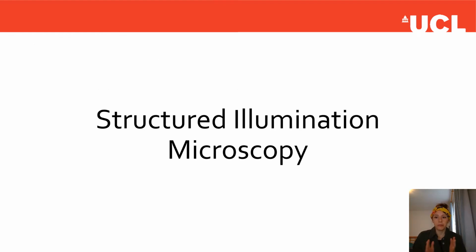So we're going to go through them one by one and talk about how they work, what's interesting about them, when we can use them, what the operating parameters are for these. We're going to start with structured illumination microscopy. And I'm going to kind of not warn you, but admit, or own up to the fact that this is the one that I personally struggled a lot to understand.